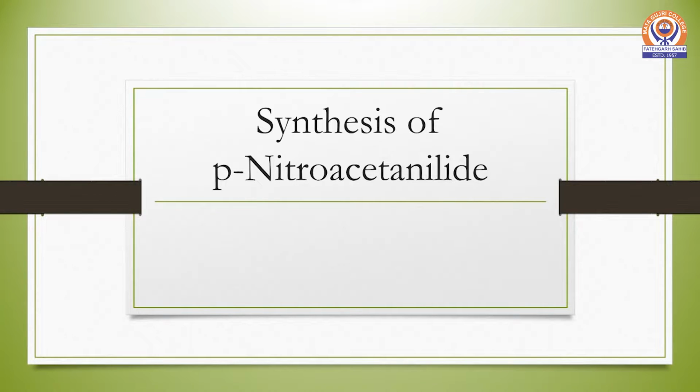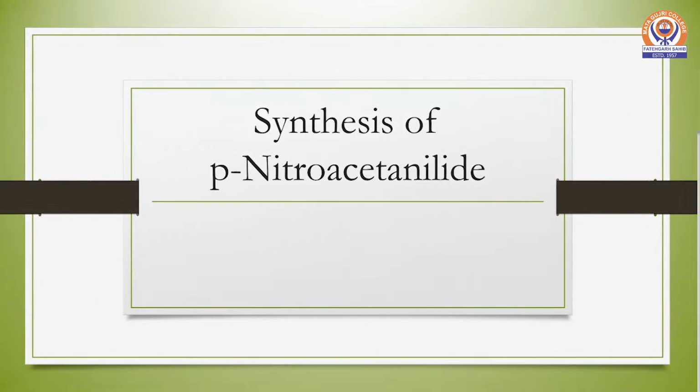Dear students, today we are going to learn how to synthesize para-nitroacetanilide.